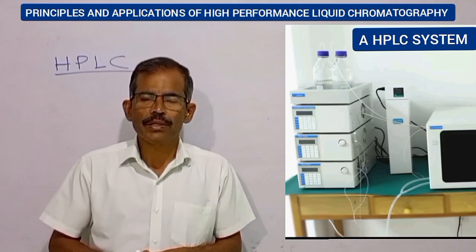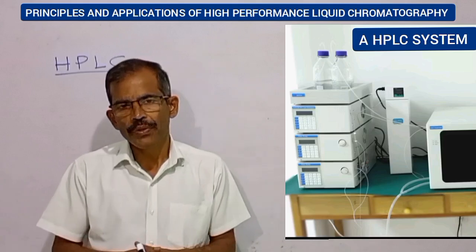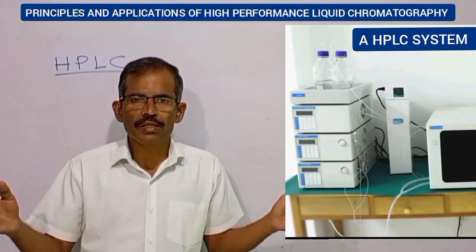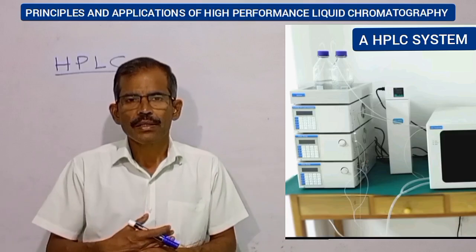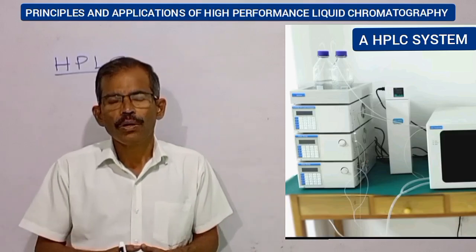Conventional supporting matrix can tolerate a pressure only up to a certain limit. At very high pressure, the matrix particles are badly affected, thereby giving rise to flow rate anomalies.